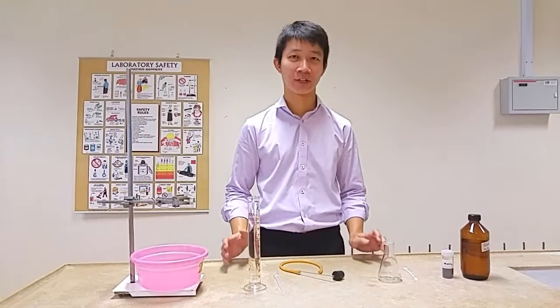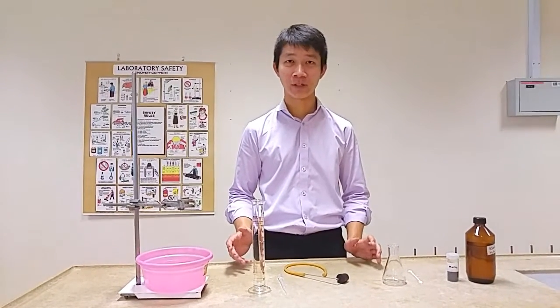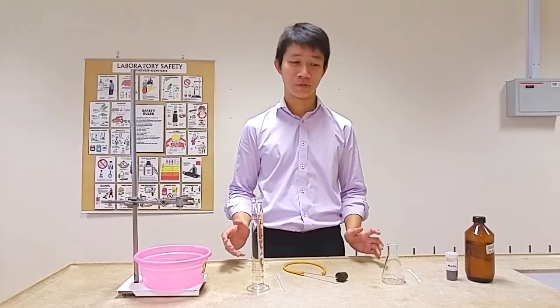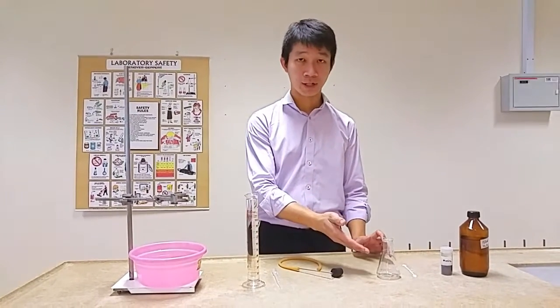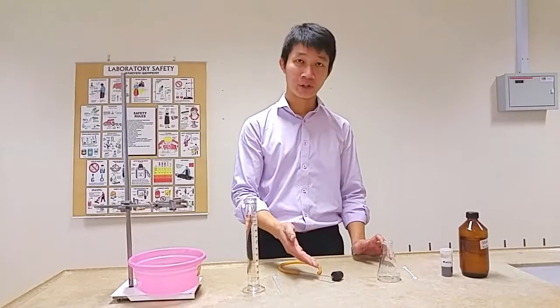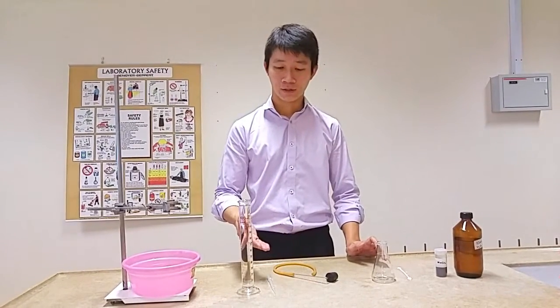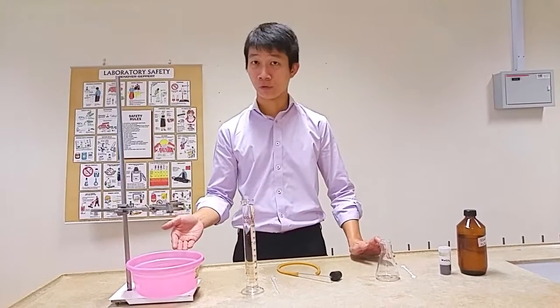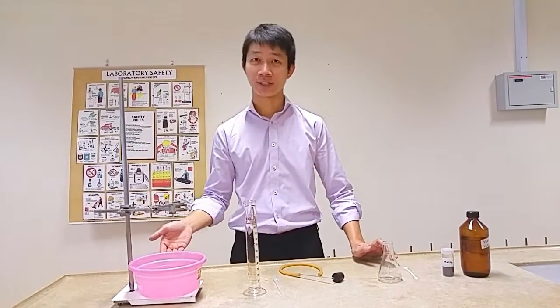Today I will be teaching you on how to conduct a gas collection experiment using the downward displacement method. The apparatus that we will be using would be the conical flask, delivery tube with stopper, dropper, a measuring cylinder, a basin filled with water, as well as a retort stand.